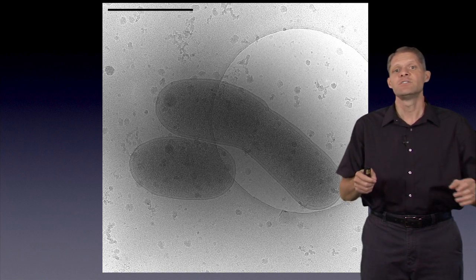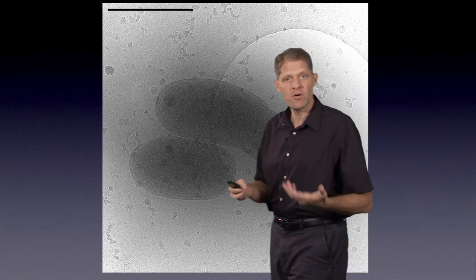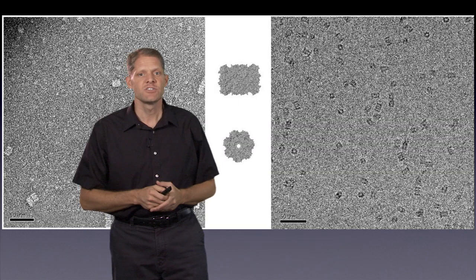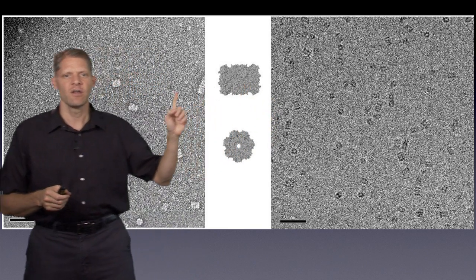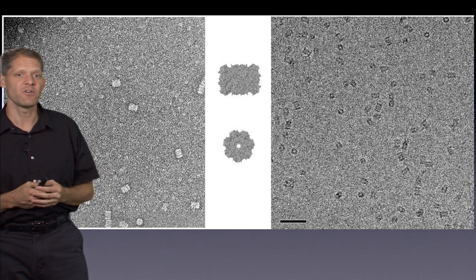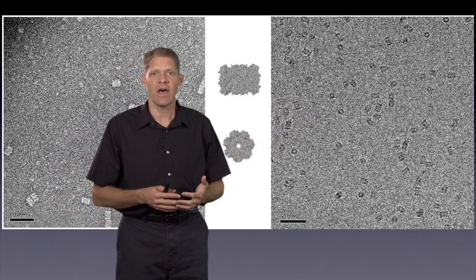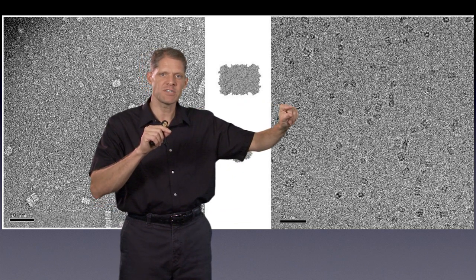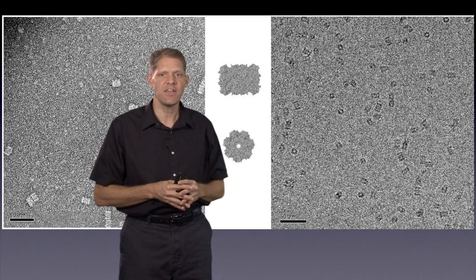For instance, this suspension of cells is quite thin. Also, you can take any solution of a protein, for instance, and spread it into a thin film and plunge freeze it. So here again is the picture of the 20S proteasomes. Over here was the negative stain image that I showed you before, showing how you could see its barrel shape. But now on the right, I show a picture of similarly purified 20S proteasomes. But in this case, they were spread into a thin film across an EM grid and plunge frozen and imaged in this frozen hydrated state.